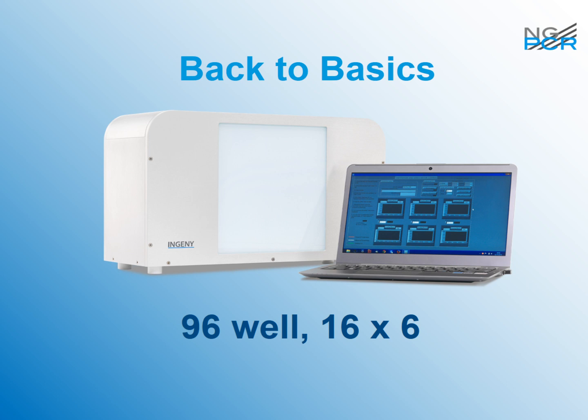And we thought 16 times 6 is also 96, and you can still use multi-channel pipettes to load it in the direction of the 16 wells. You can load 1, 3, 5, 7, 9, etc. And then the next load you load 2, 4, 6, 8. And we thought, okay, that's good, that's cool. And with this system, we brought the PCR 30 cycles down to around 3 minutes, which was quite amazing.